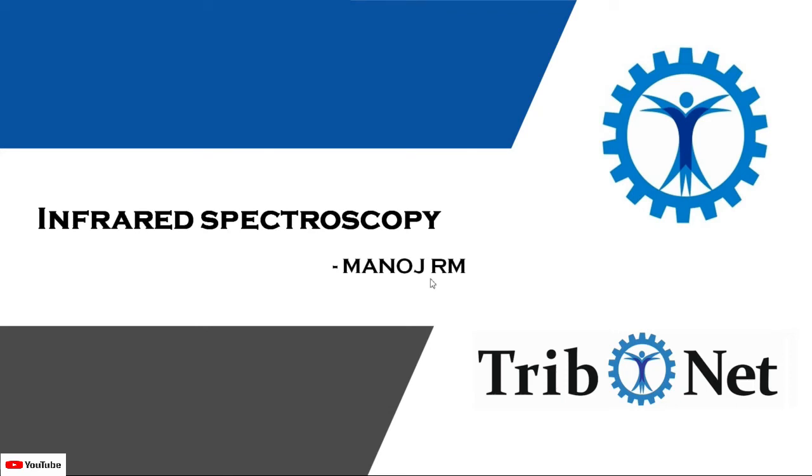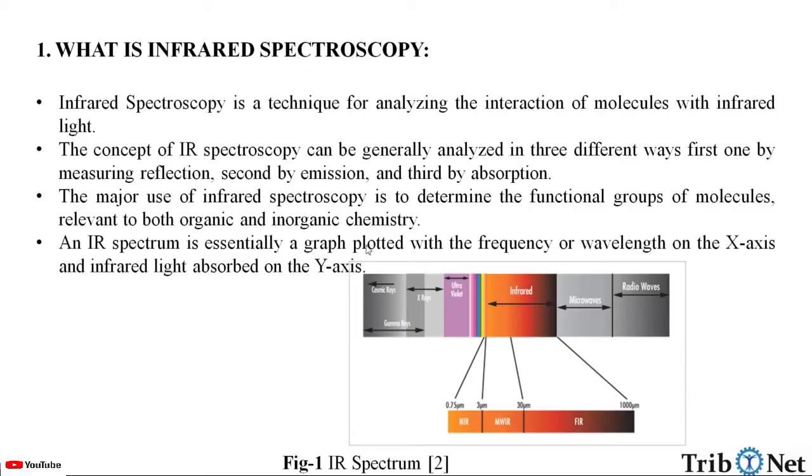My name is Manoj. Today, let us understand about infrared spectroscopy. What is infrared spectroscopy? Infrared spectroscopy is a technique for analyzing the interaction of molecules with infrared light.